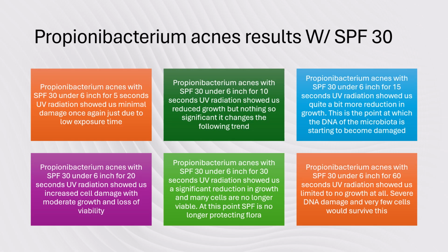So after going over the results we had with P. acne covered with SPF 15, we'll now go over SPF 30. Under 6 inches of light for 5 seconds, once again, this follows the trend of almost none to minimal damage. The exposure time is just so low. And you see about the same thing at 10 seconds. It shows a little bit of a change, but nothing significant at all.